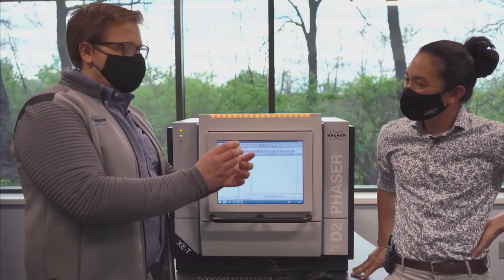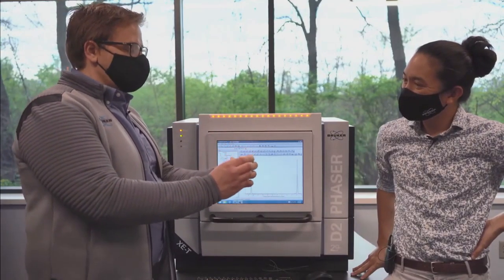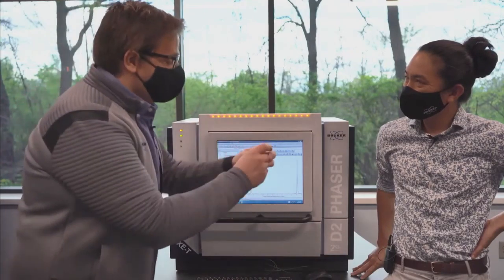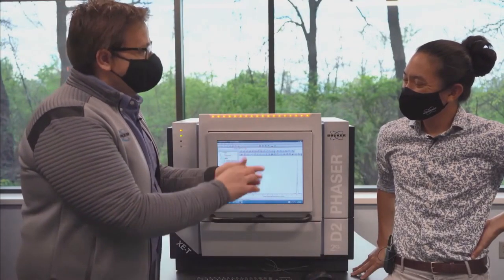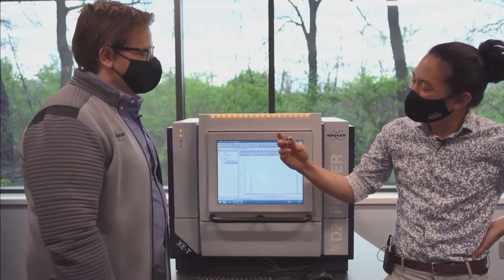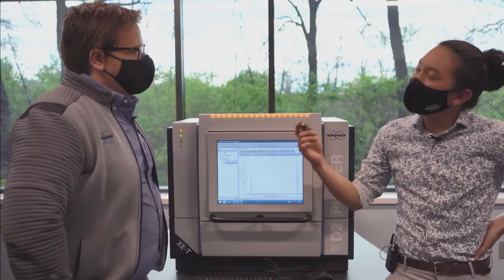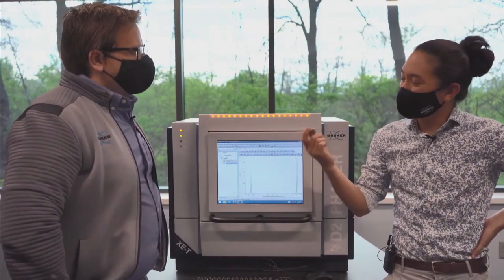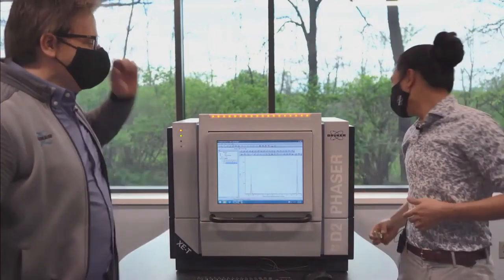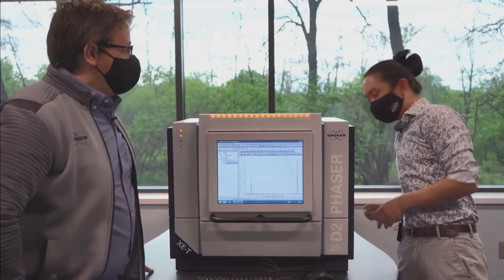As some may know, I am a materials scientist with a thin film background, so I would call this cube light. I don't know. Gold. It looks like gold. That looks like gold to me. Particularly that side right there. I don't know many scientists that carry around a chunk of gold this big in their pocket. Yeah, right? Not that lucrative. But what this is actually, is pyrite.